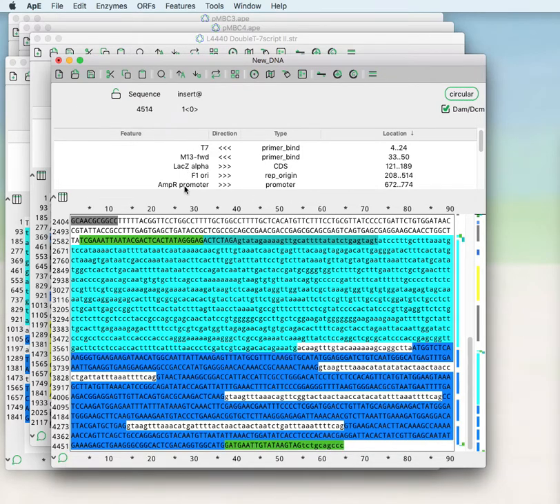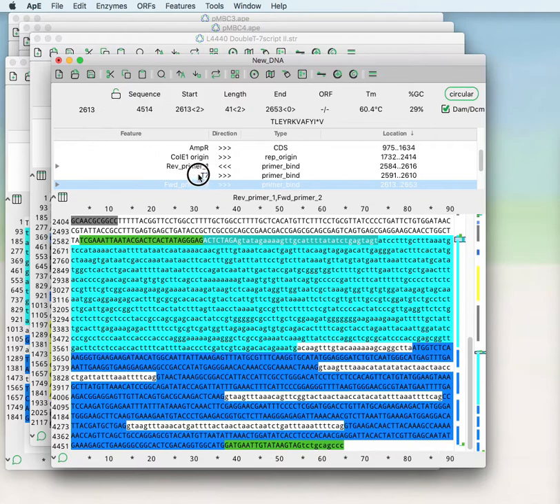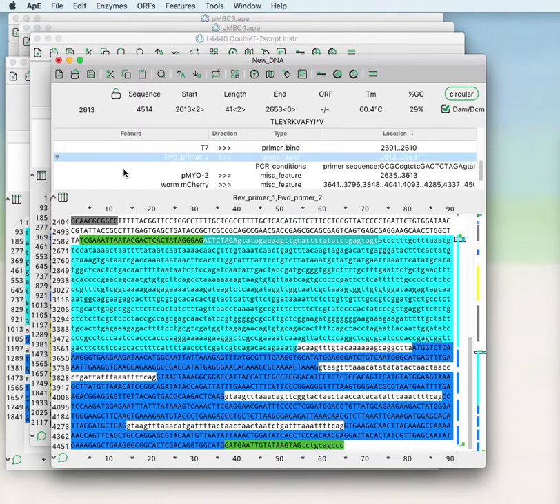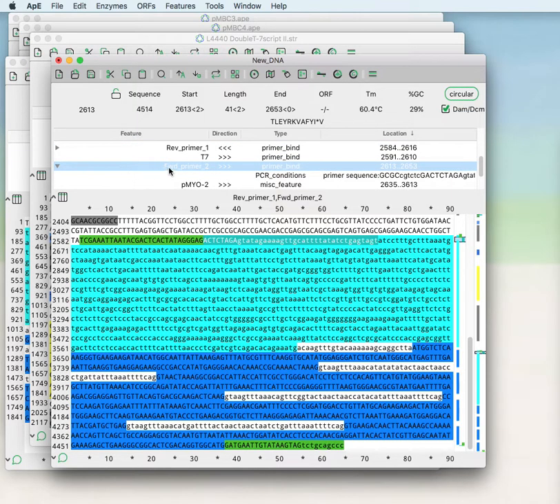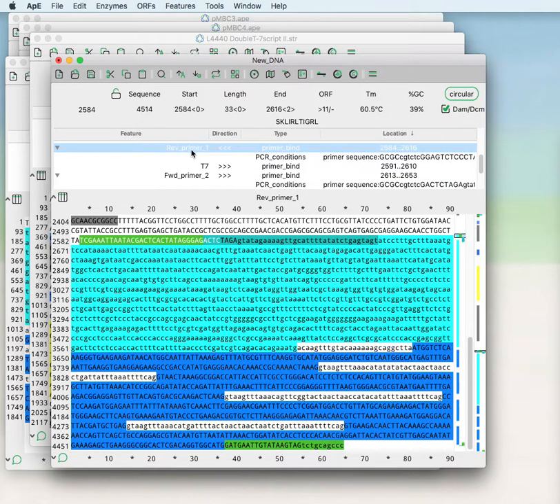Then if you look in the feature table you see that these primers have a little triangle that can be used to display further information. And you see that the primer sequence has been saved within the feature for each of these PCR primers.